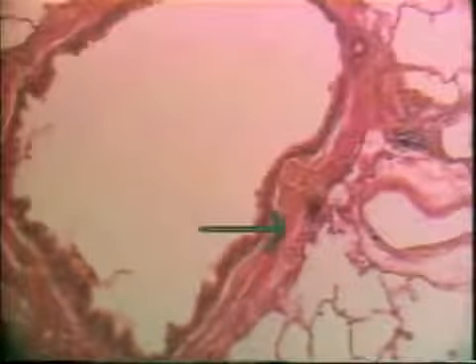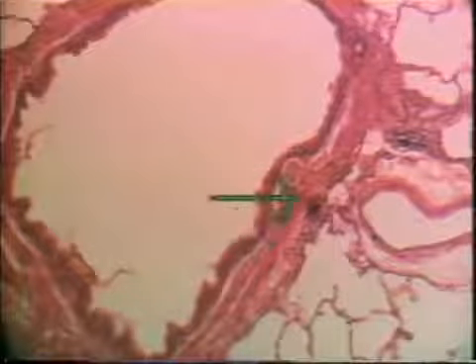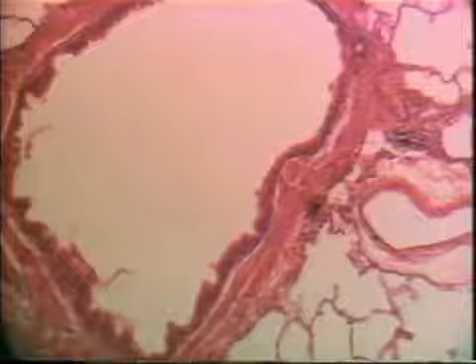These are smooth muscle wisps running in the wall of this bronchiole. The epithelium, still ciliated, and it has goblet cells in it, respiratory epithelium. Of course, it's getting less in dimension, less thickness, of course.